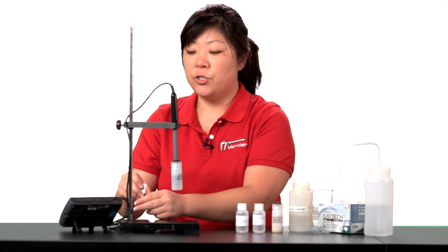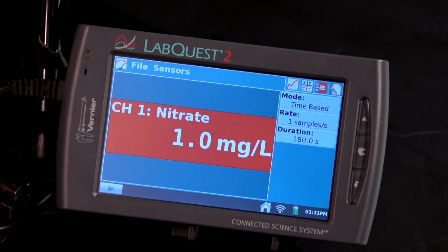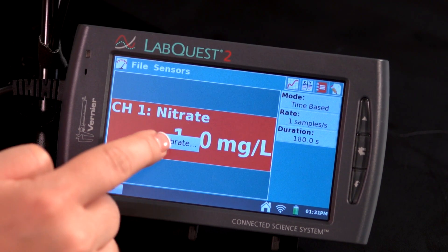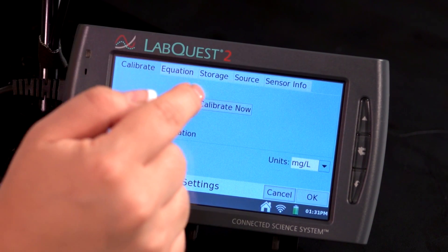Then connect the sensor to LabQuest 2. The data collection software will automatically identify the sensor. Tap on the red box and choose Calibrate. Tap on Calibrate Now to start the calibration process.